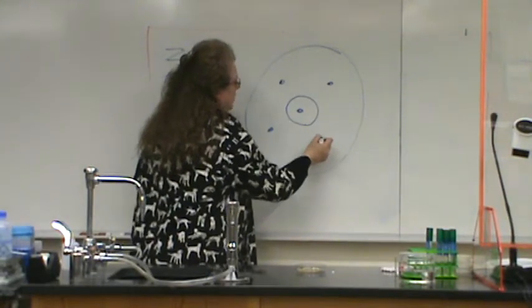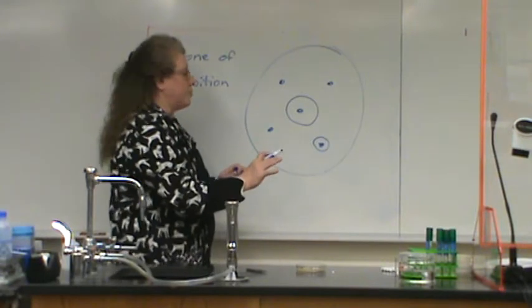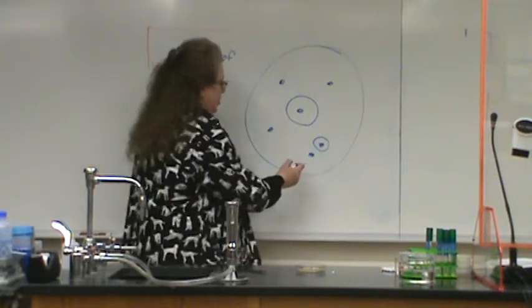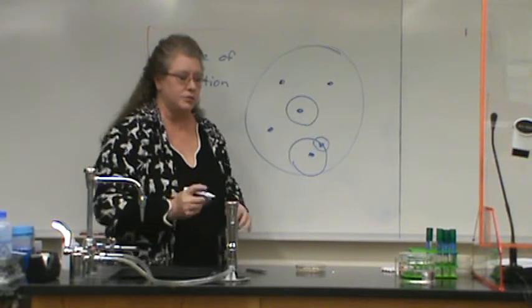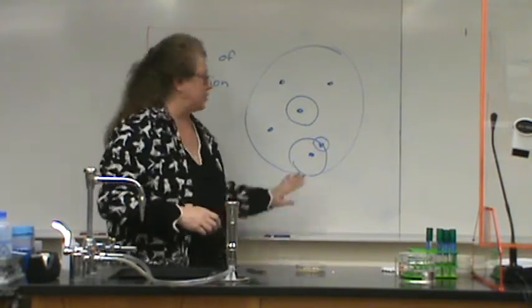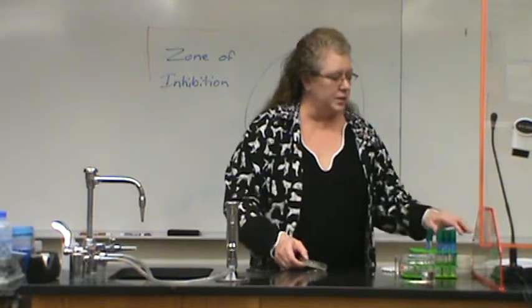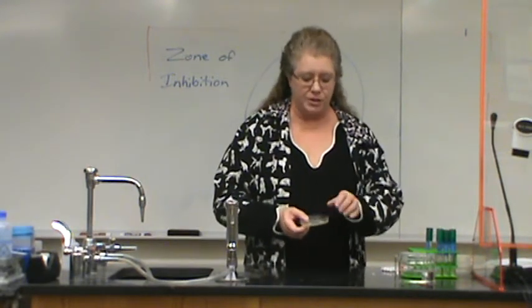Some may have a smaller one, some may have none. There'll be 0. But for instance, if you would have put the discs really close to each other, and this zone ran into that one, it can be hard to tell. So you want to space them away from each other and away from the edge so that you can clearly see any zone of inhibition that may form. So we did this with Staph aureus. You're going to continue or repeat this procedure to do the other 3 bacteria.